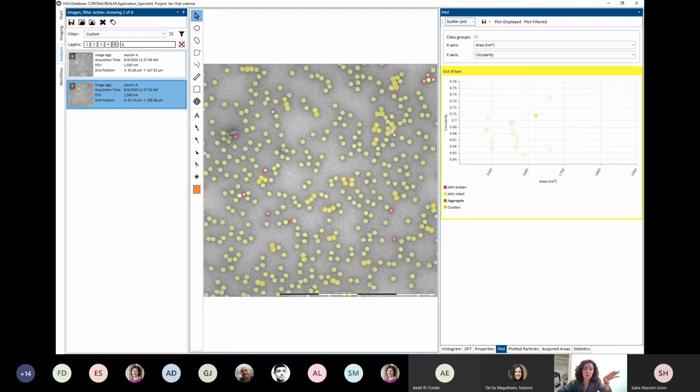So I do a lot of the image acquisition from home, just so you know. I'm just thinking in terms of lockdowns and so on, this microscope can be run remotely with the image analysis as well. So we can find different ways for you to still interact very much with us, whether you want to just take the images, talk to Salome, take the images and then we do the image analysis together, or if we want to do the imaging remotely together, that is also possible.